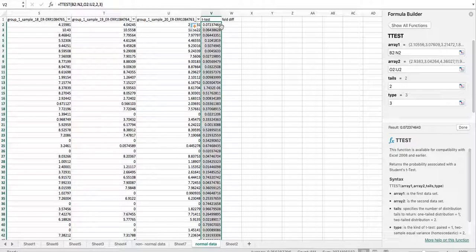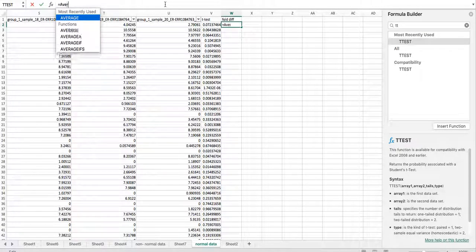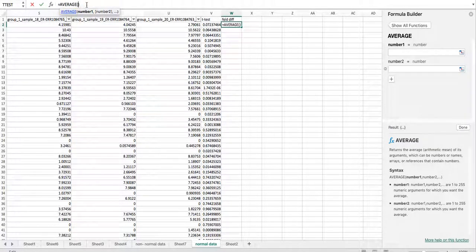If you double-click that cell, it will fill up all the rest of the cells. Then we want to calculate the fold difference, so we type in the average function — we want to take the average of the first range.